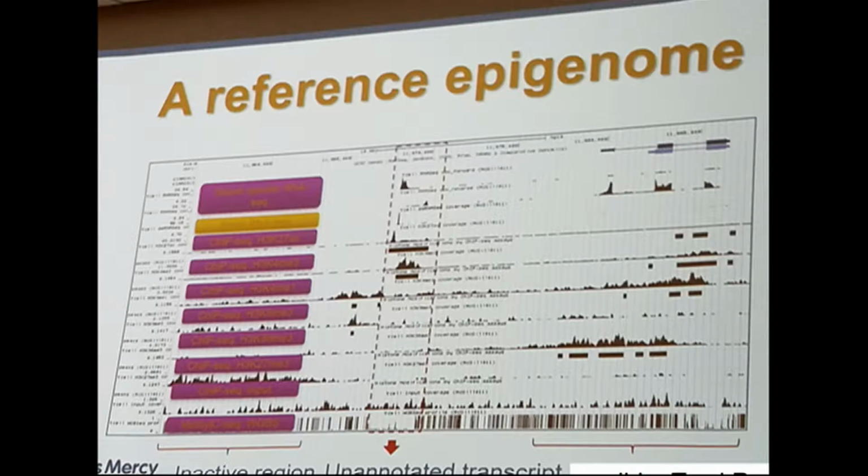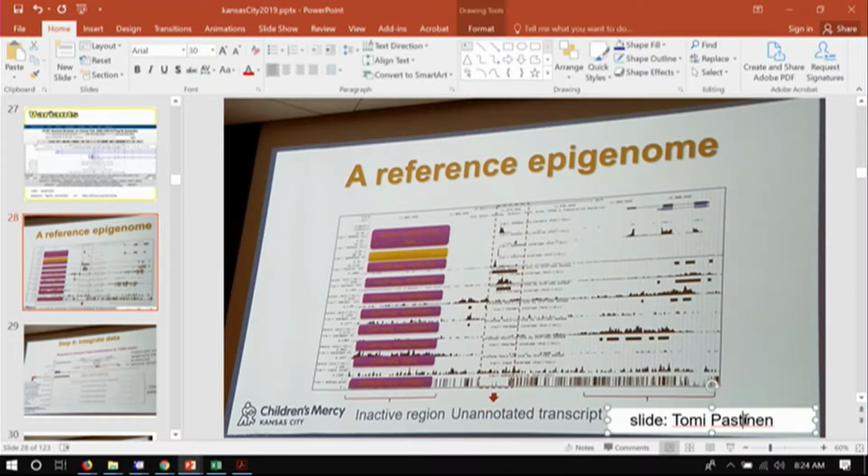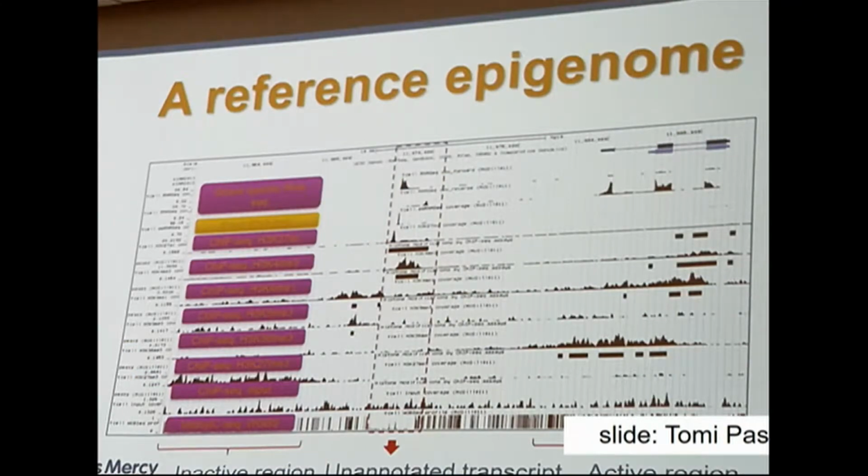Okay, so I was thrilled yesterday to see, whoops, it's cut off at the bottom of the slide here. There's an acknowledgement down there, the source of the slide. I should at least acknowledge him once there. Let's grab that and drag it up a little bit for you. There we go. In yesterday's talk, a genome browser screenshot showed up while I was watching, and it shows you a couple of the data types. These are data sets that were loaded into the browser in Wiggle format, and so you can see that it shows you a peak in 2 dimensions.